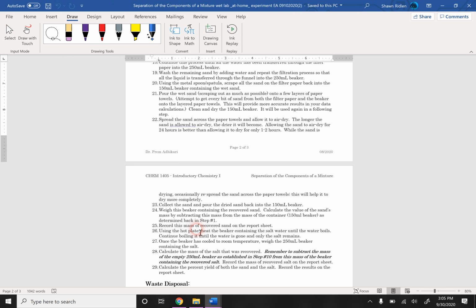Don't just crank the heat to the maximum setting and walk away. That's not going to be good. You're going to end up hurting someone or hurting something. Okay, so medium setting and just be patient. Something like that. But you really don't need a huge roaring boil.